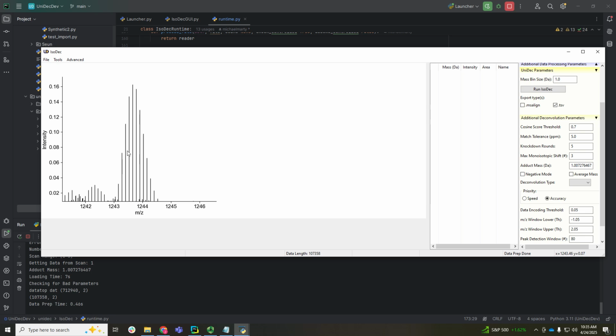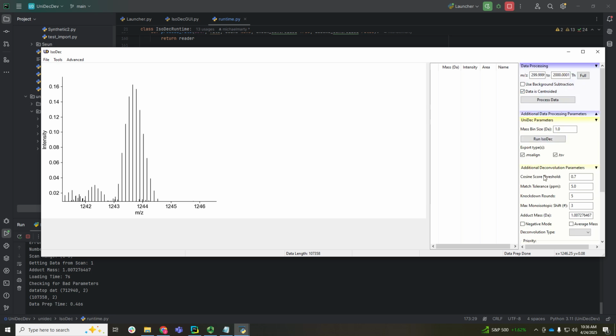Basically, this is a pretty clean distribution, but in cases where we have uglier, noisier distributions, that can allow us to more accurately determine the correct monoisotopic mass, where the most intense peaks in the experimental and theoretical spectrum shouldn't line up. The highest scoring shift is then calculated back to a monoisotopic mass, and the highest scoring one is reported as the monoisotopic mass for that envelope. Although if multiple shifts meet our filtering criteria, they will also be returned.